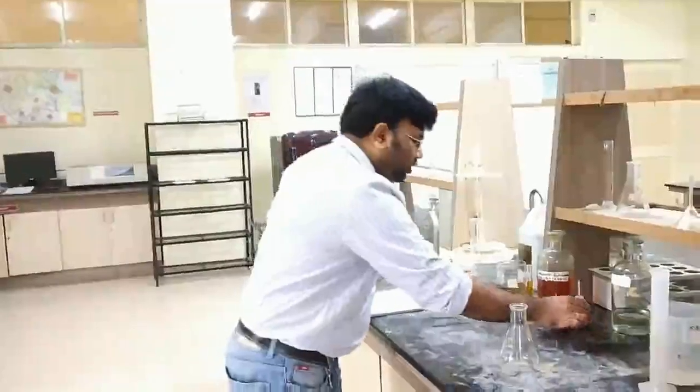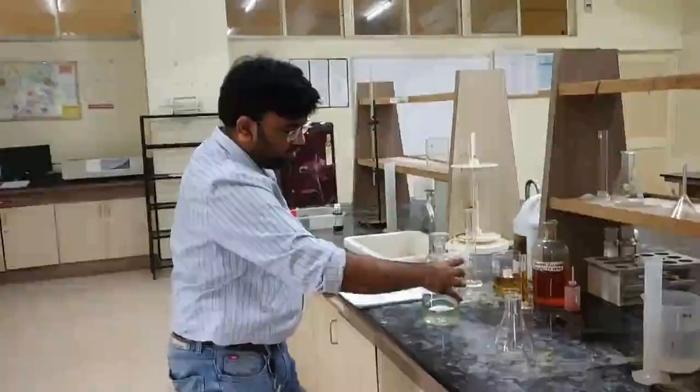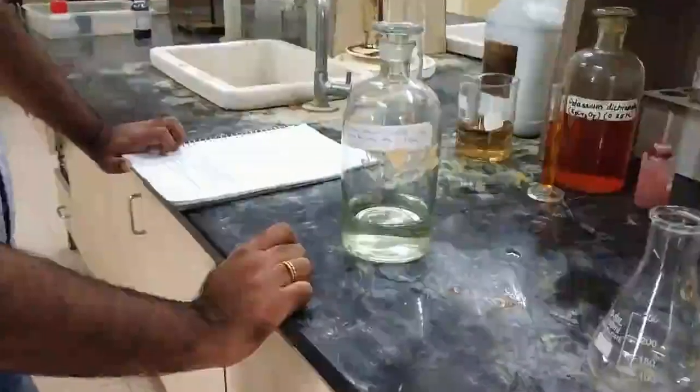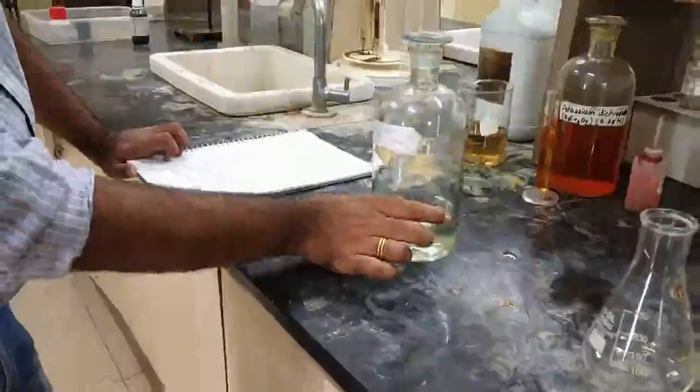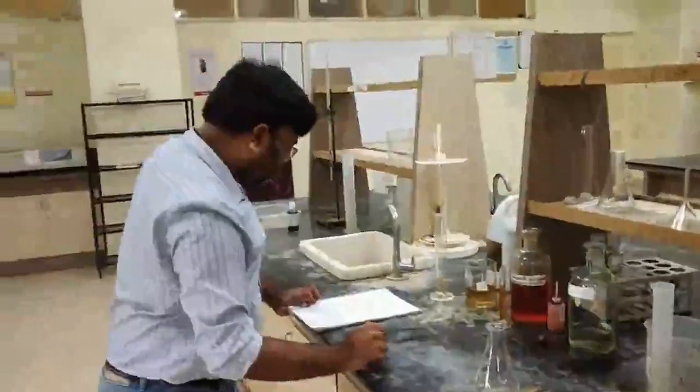So this is how the FAS solution looks. It is a bit transparent, but it has a luster, and because of that it has a sparkling effect. So this is the ferrous ammonium sulfate that we have. Right, so we are going to find out its normality.